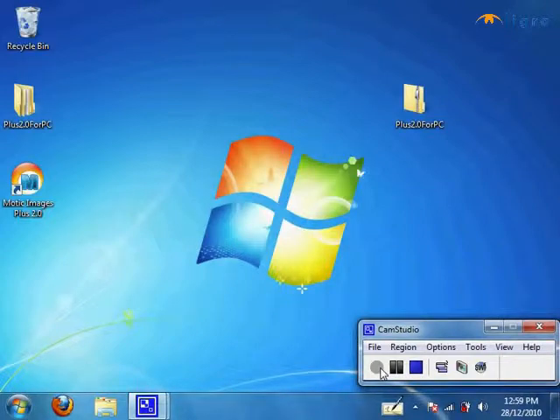You will also need to download the software. The instructions for that are also inside the other video. Once you have downloaded the software as a zip folder, please extract it onto your desktop, Plus 2.0 for PC. The driver that we will need to manually install is inside that software. This will also apply to Motic Play or Motic Educator.